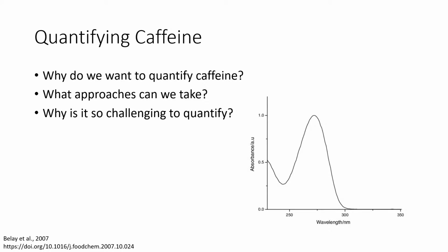So quantifying caffeine, why do we want to quantify caffeine? Like I said, it's a potential toxin and there's a lot of sources. And if we're making a beverage, we want to be able to label our beverage with the amount of caffeine in it so that our consumers can track how much caffeine they're taking in from all these different sources.